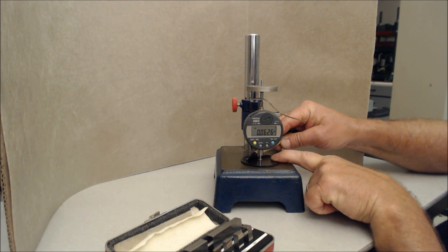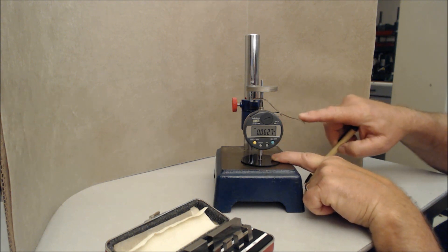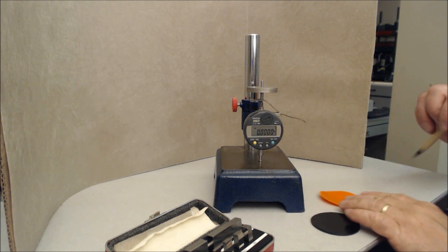I'll use the pen so you can see it. 62.6 or 62.7 mils in thickness, or 0.0627 inches in thickness. This is for the geomembrane. You'd like to see it go back to zero, which we did.